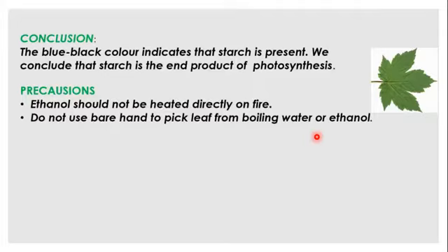Then what do you use to pick the leaf? Forceps. The bigger forceps is what food vendors use for picking macaroni, salad onto our food. That's a bigger one.